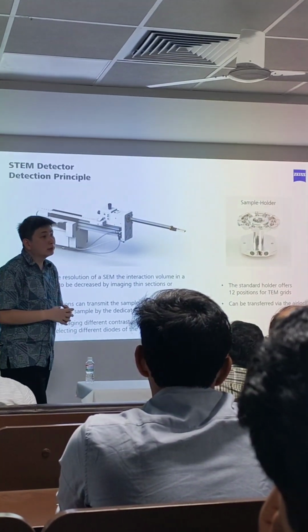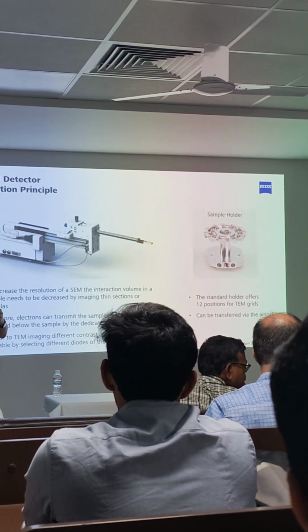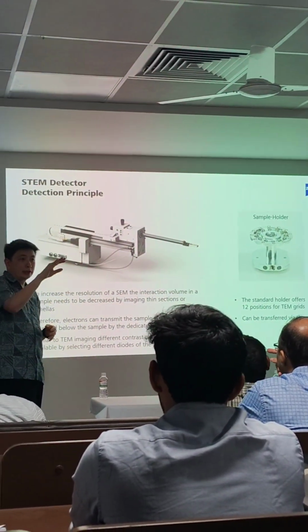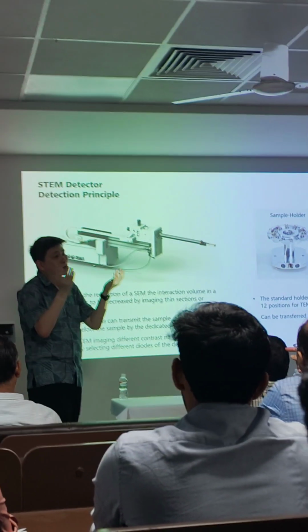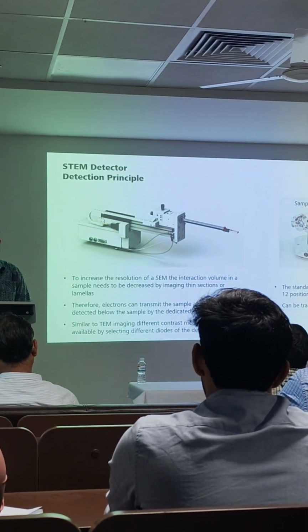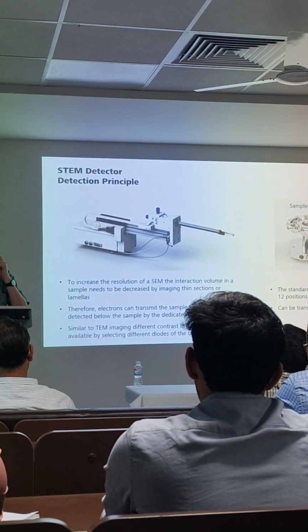10 nanometers. Yeah, 10 nanometers. So this is, yeah, 100 is okay. 20 I think is the optimum, but 100 is fine. I mean, there's not much difference between 20 and 100, to be very honest. So this is the same TEM sample that we put in, right? Yes, the TEM station.